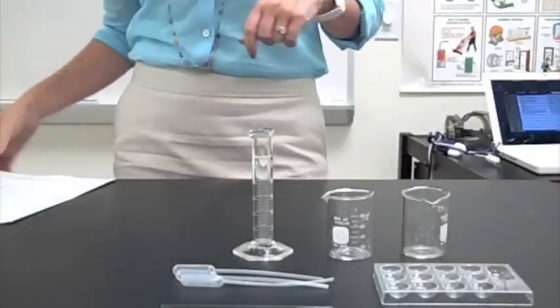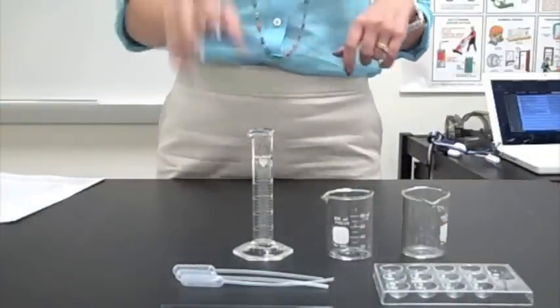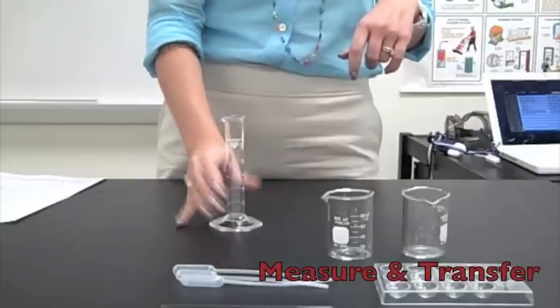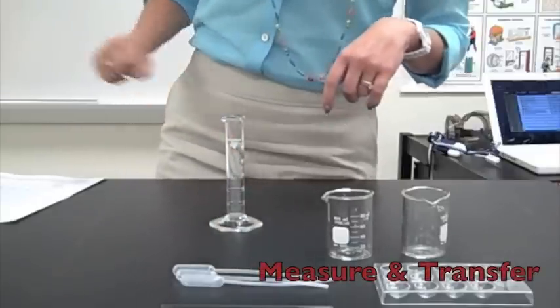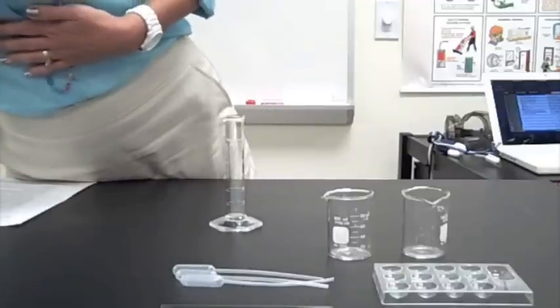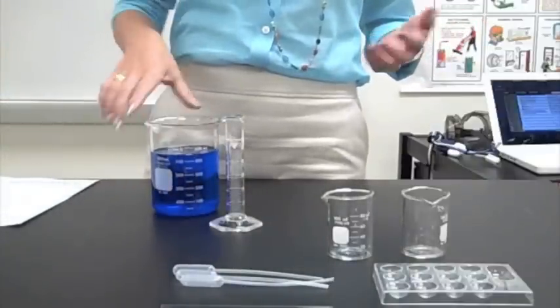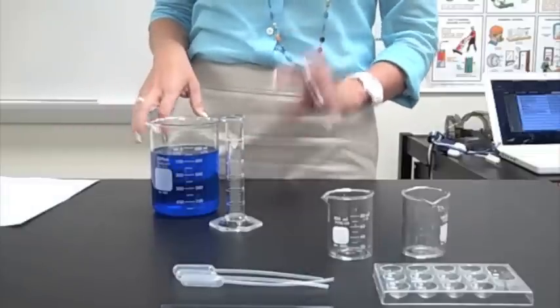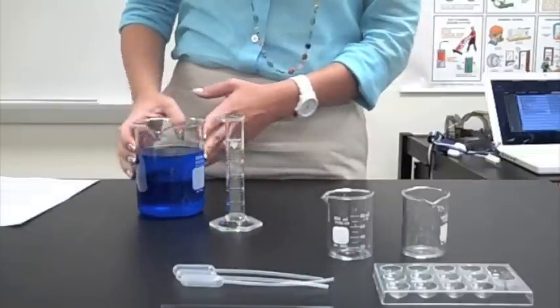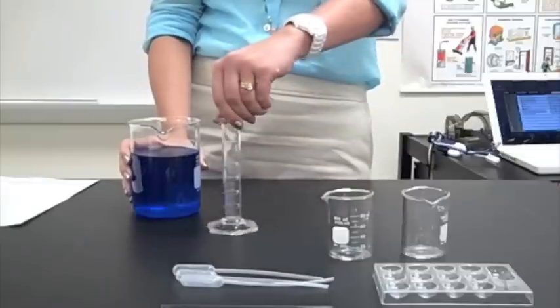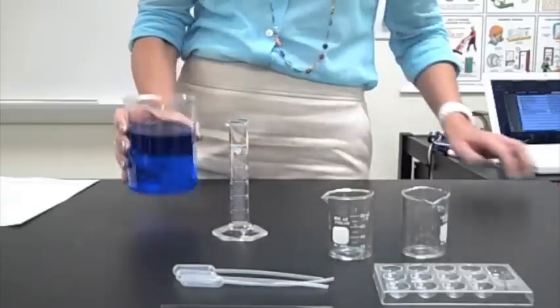This is the equipment that you'll need for the liquids part of it. First step says, using the 25 mL graduated cylinder, measure 14.5 mL of the blue solution. On your lab table, it will already be here when you get set up, will be a small beaker of blue solution. And it says we need to get 14.5 milliliters.